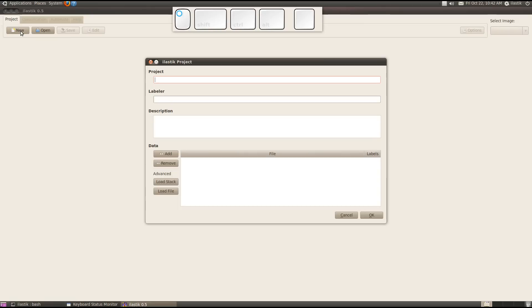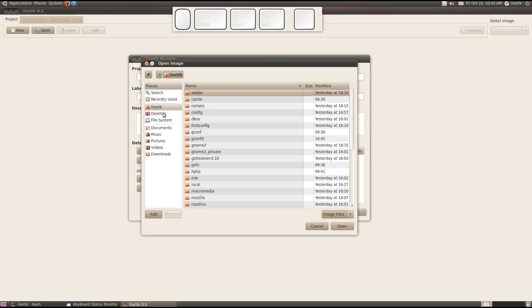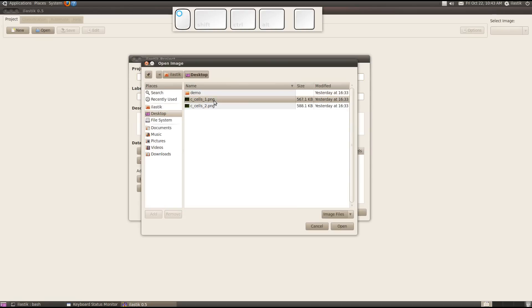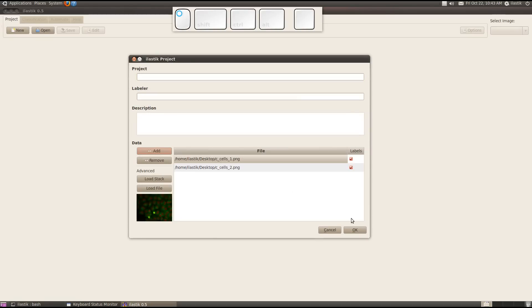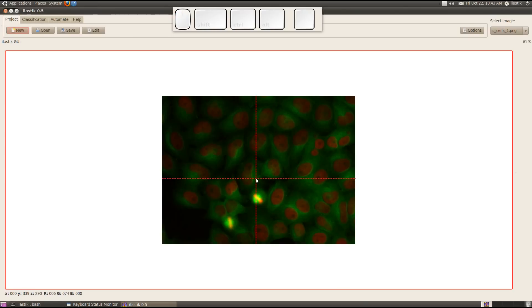I click on Create New Project and here in the dialog I could enter some meta information. But for now, let me just add some images. I take those two cell images and now they are displayed.